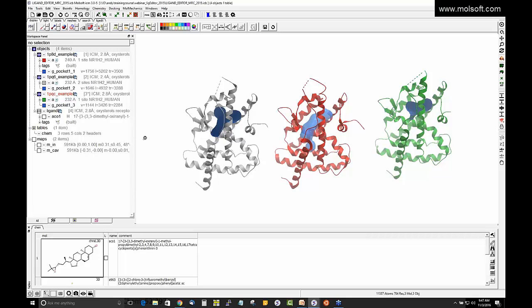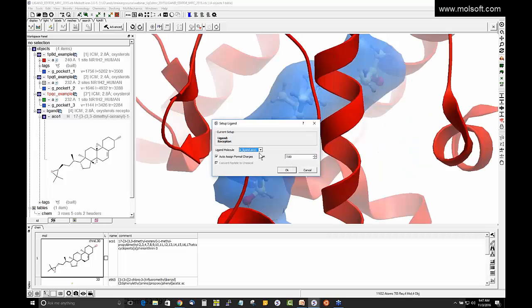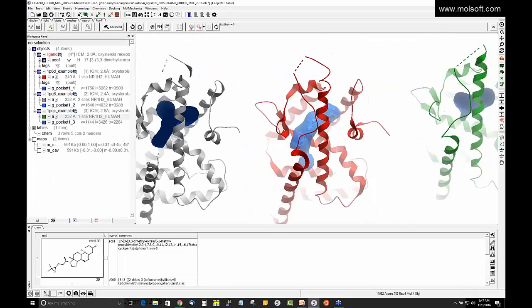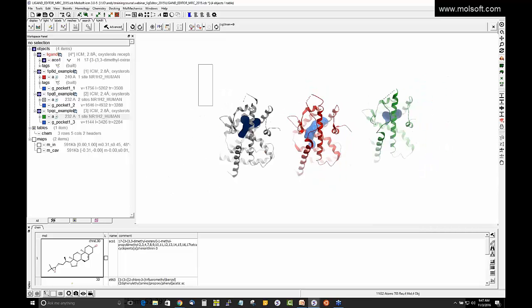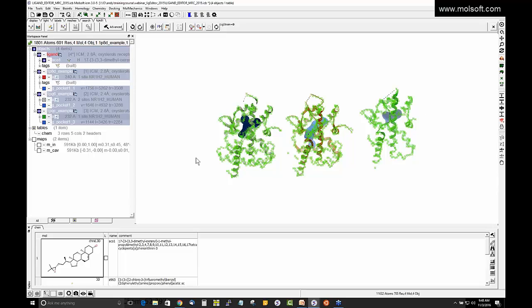To do that, this is called 4D docking. We go to the Ligand Editor. We have a nuclear receptor inhibitor here, which we're going to edit. So I'm going to go to the Ligand Editor, go to Ligand Setup again, and choose the ligand, which is ACO1. Just go OK. And then in order to dock to this ensemble, we need to superimpose them.